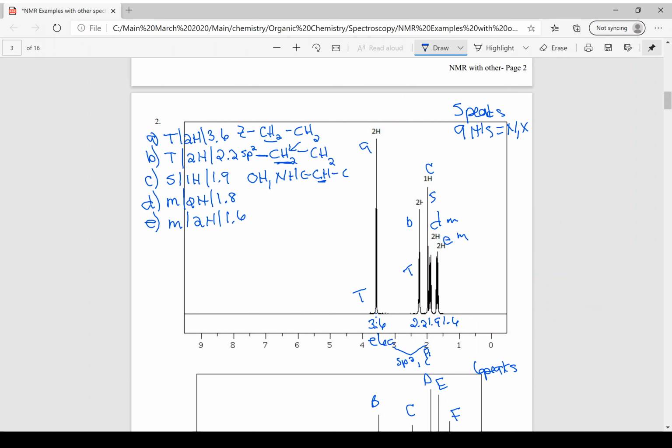Now we don't use them very often, so notice I put a little sp2. Remember, we don't fall in love with anything. We knew it was shifting, it was doing something unique, and it just didn't turn out to be that one. So from future ones, I found out that it was this from those other spectra. All right, so I took care of that one, and I know that there is a CH2 connected at the end. Okay, I know this has to be at the end.